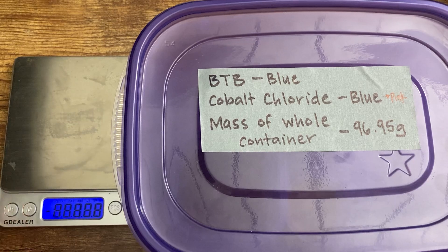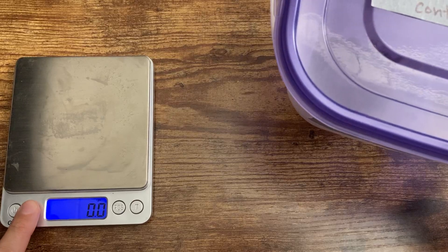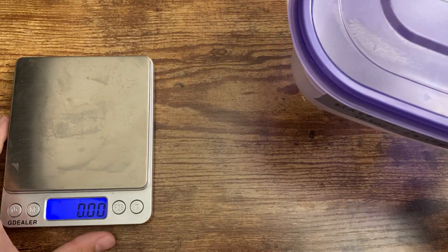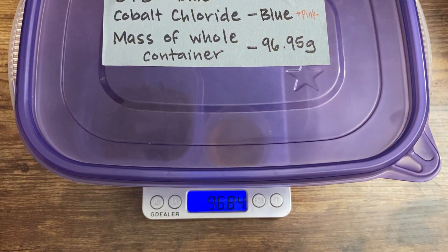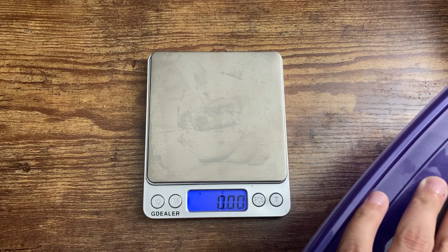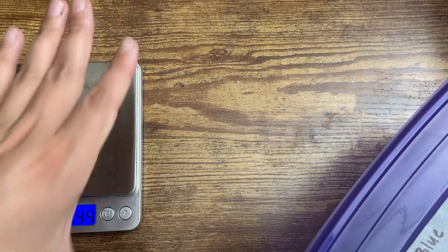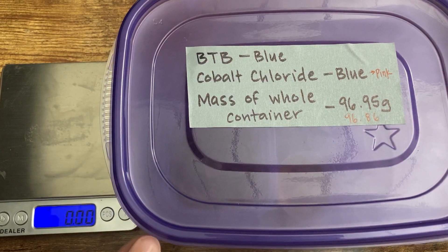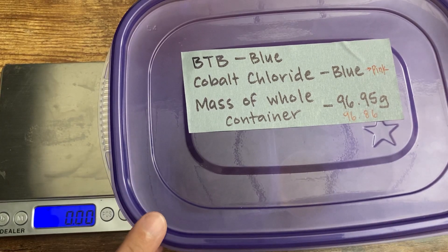The first thing I want to do is measure the mass of the whole container. I need to make sure this is on grams — it's currently reading zero. When I put the whole container on, the mass is 96.86 grams. So the mass of the whole container has actually gone down a little bit. That could be because this is not making a perfect seal, and it might have lost a little bit of air.